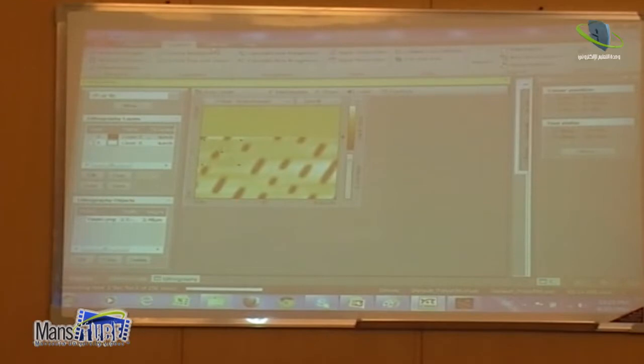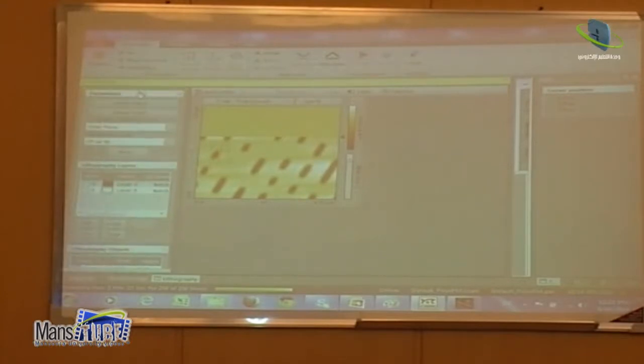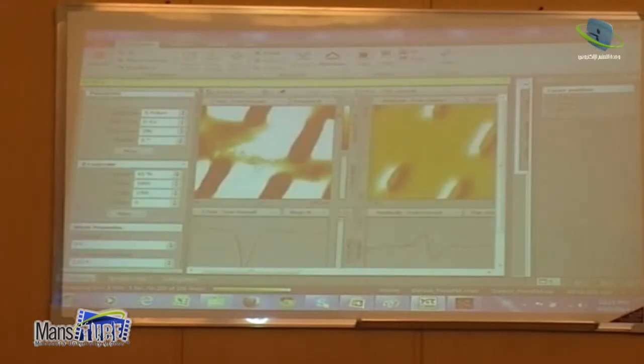I have acquisition. I think that. Yeah. I need, I didn't yet start. I need first to load the image. I mean, problem imaging from here. This is not good.